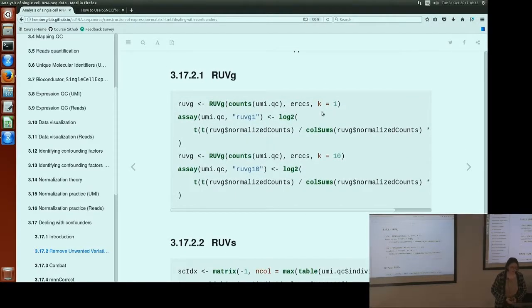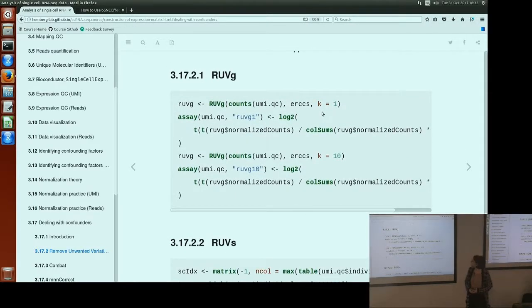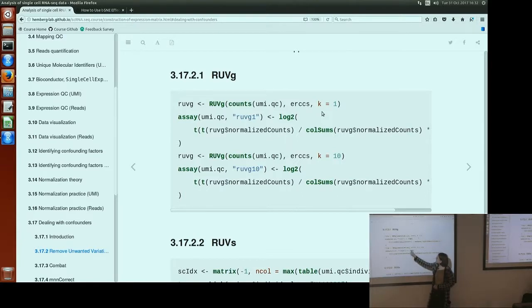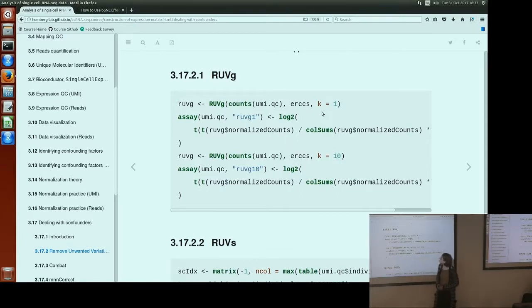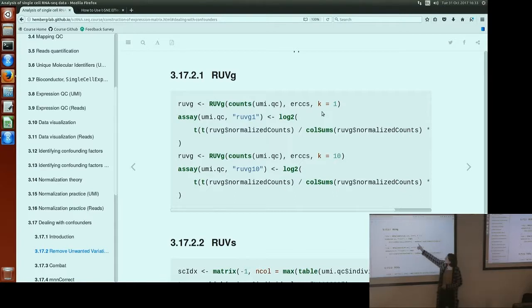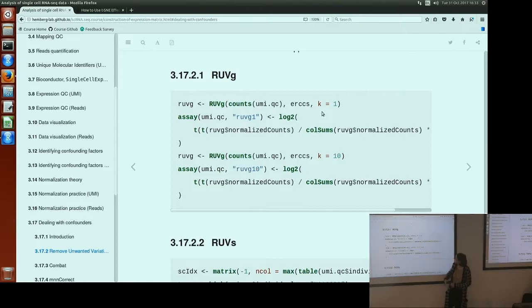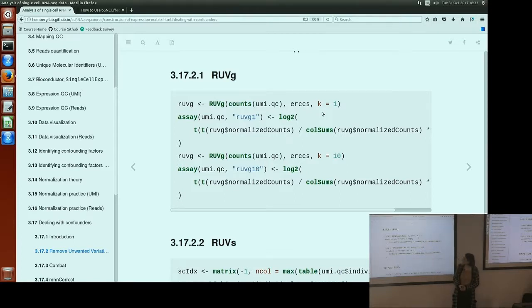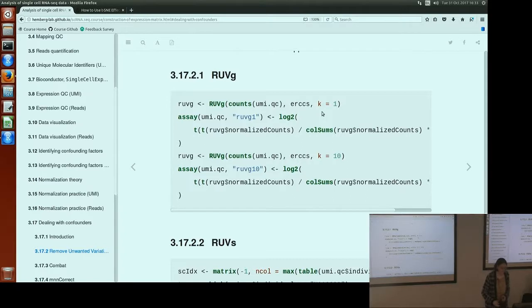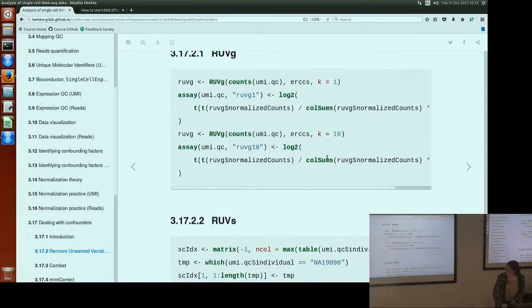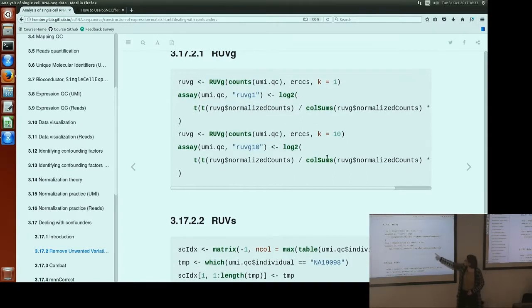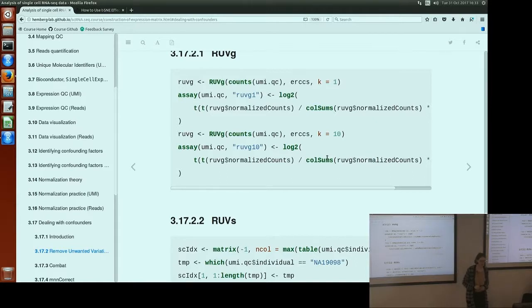This is how you run RUVG. So RUV assumes you've given it counts, so we have to give it the raw count matrix. And then we specify which genes are the spike-ins or the control genes, so we've chosen the ERCCs. And we have to specify the parameter K. And then we can also increase K to a higher level to remove more unwanted variation from our data.